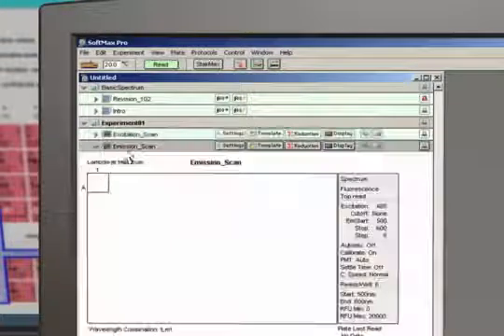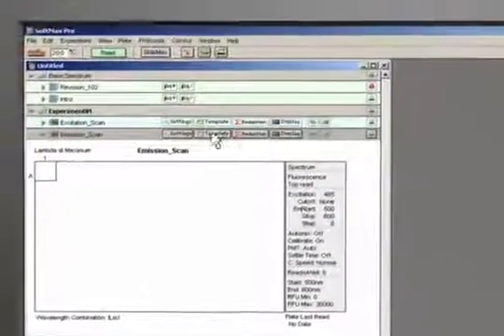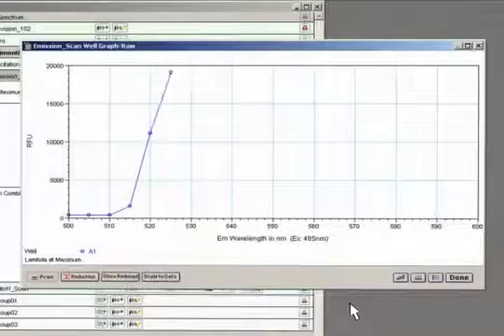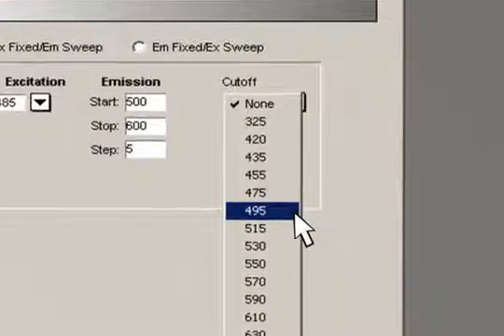Now we do the exact opposite as before: fix the excitation wavelength with the new value and scan for the proper emission wavelength. The emission scan proceeds and we are presented with a graph of your emission maximum. Lastly, we can select an appropriate emission cutoff filter to eliminate any stray excitation light.